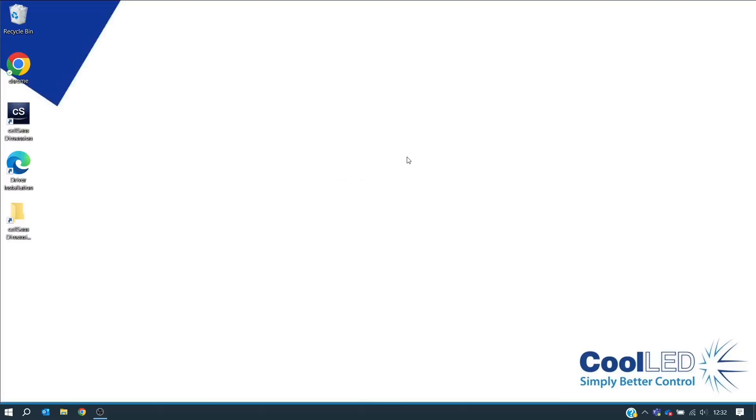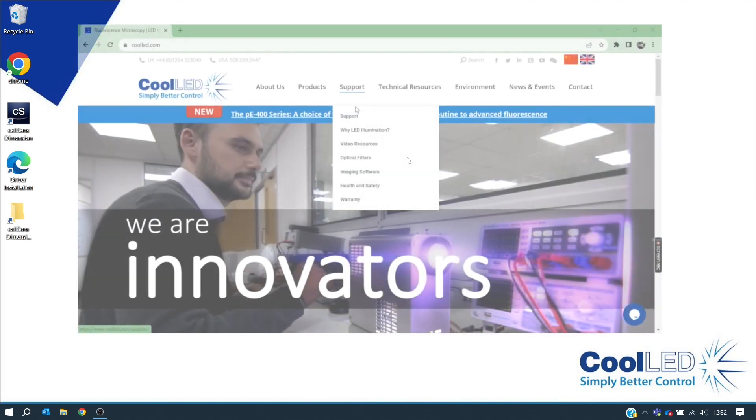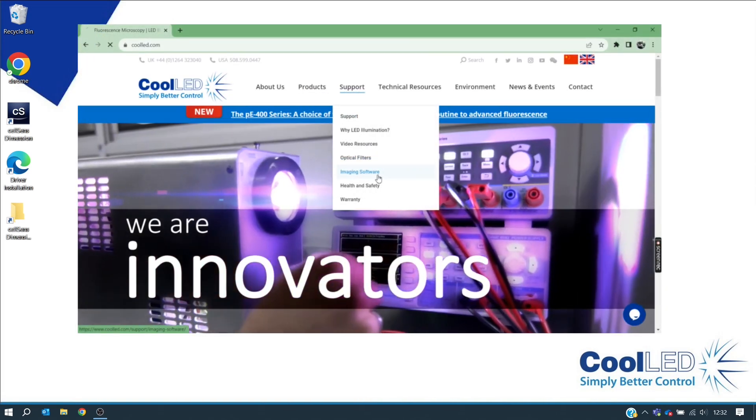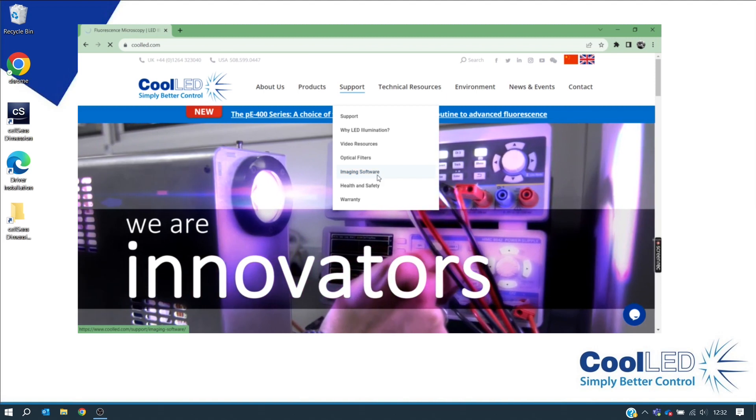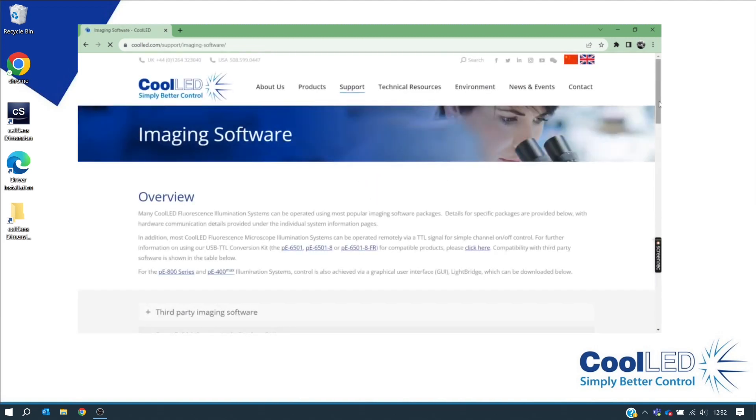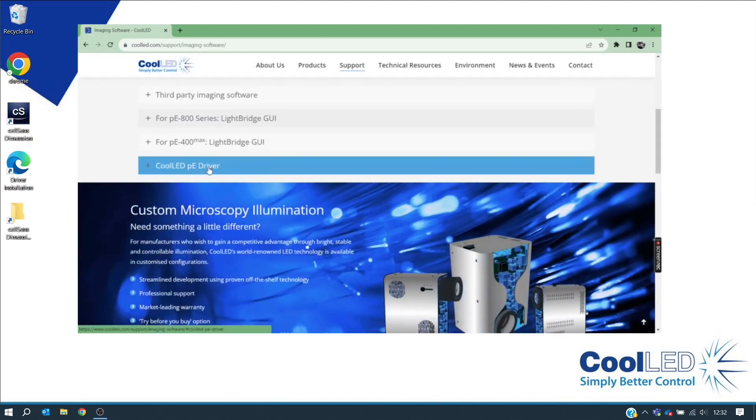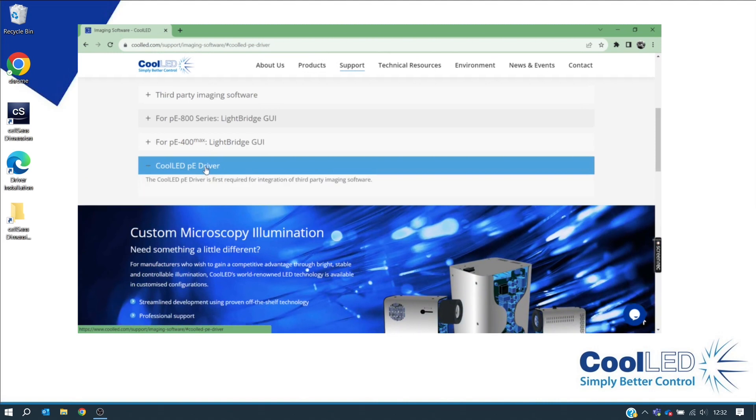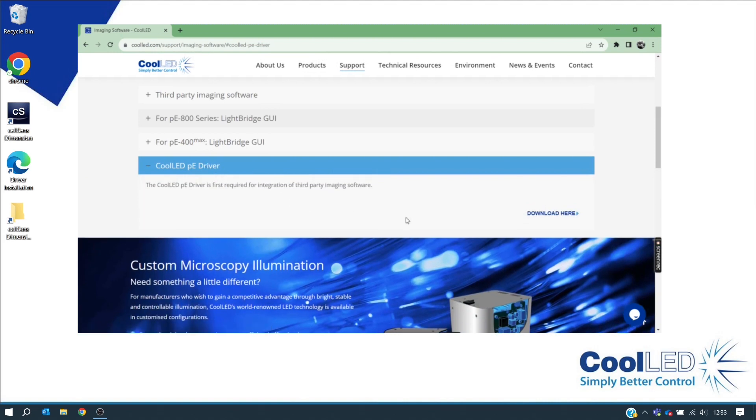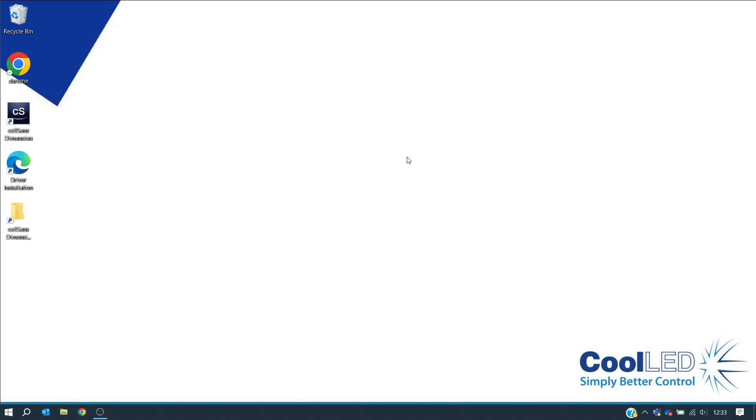Before we launch CellSense, there are a few steps we need to complete. Firstly, you may need to install the Cool-LED PE driver if you have not done so already. Unless you are using the PE800 series with Windows 10, you will need these drivers which can be downloaded from the Cool-LED website, and please refer to the installation video for further guidance.